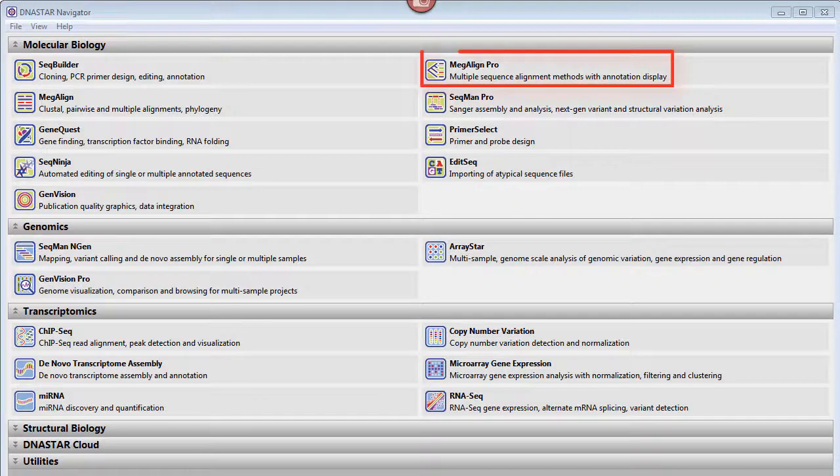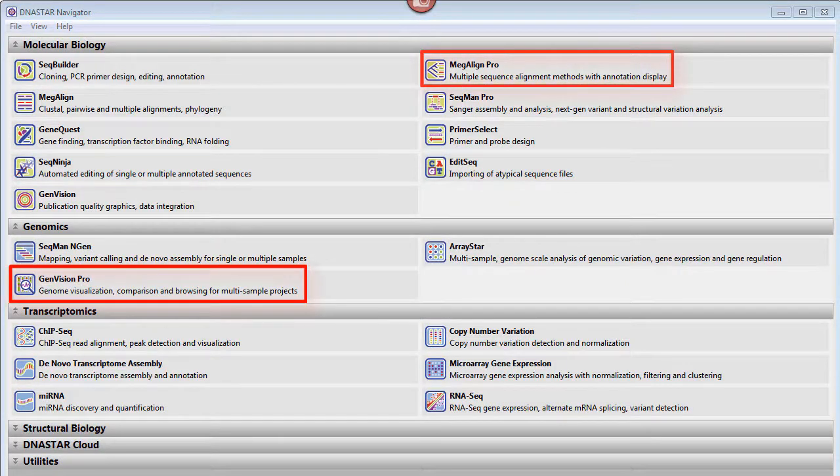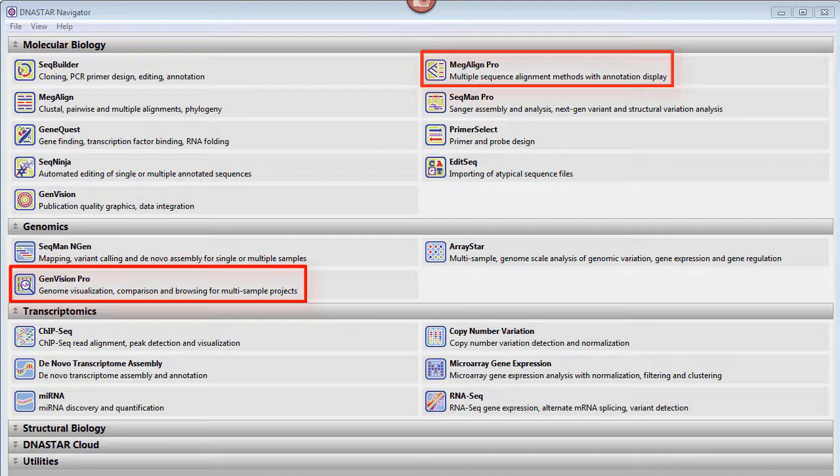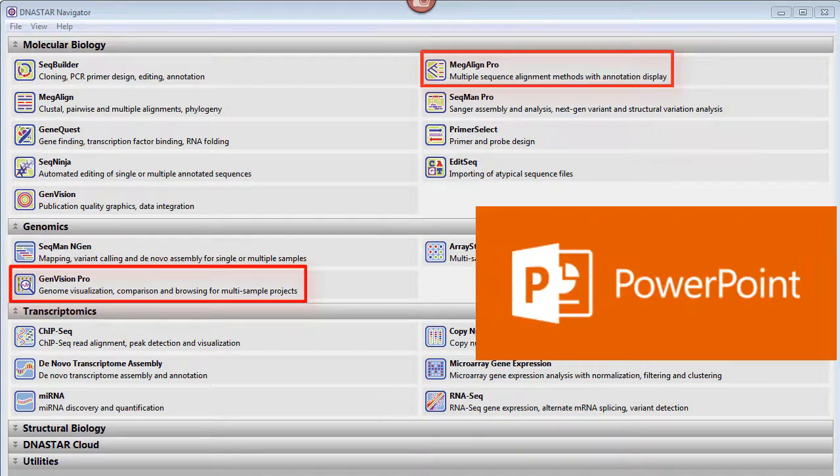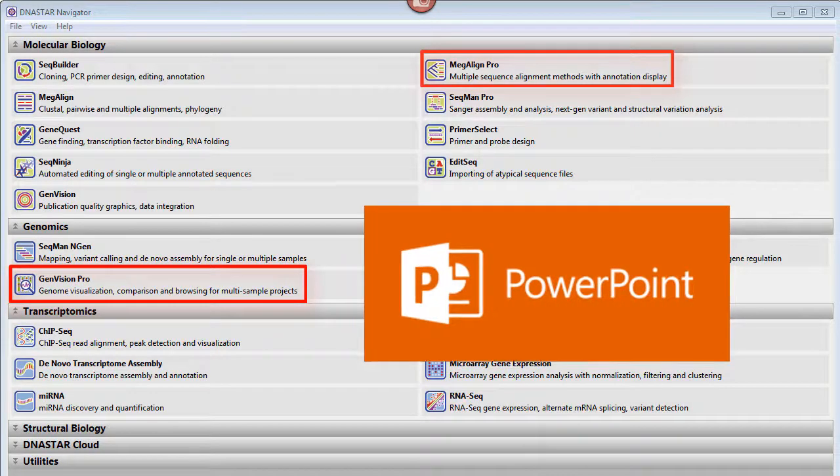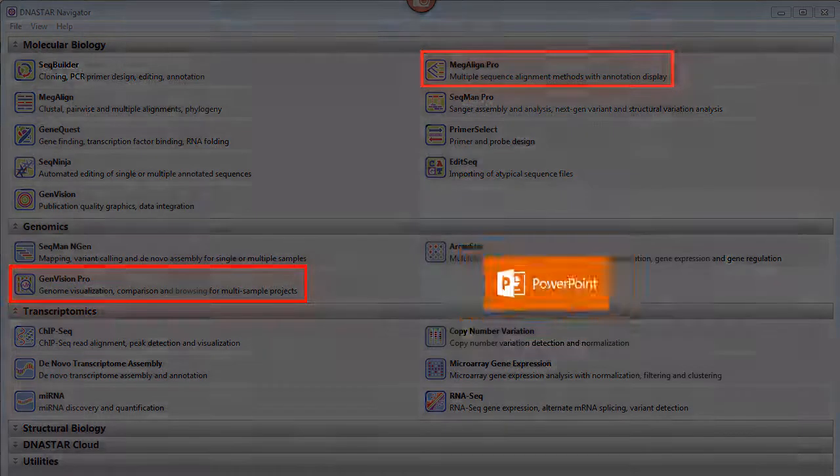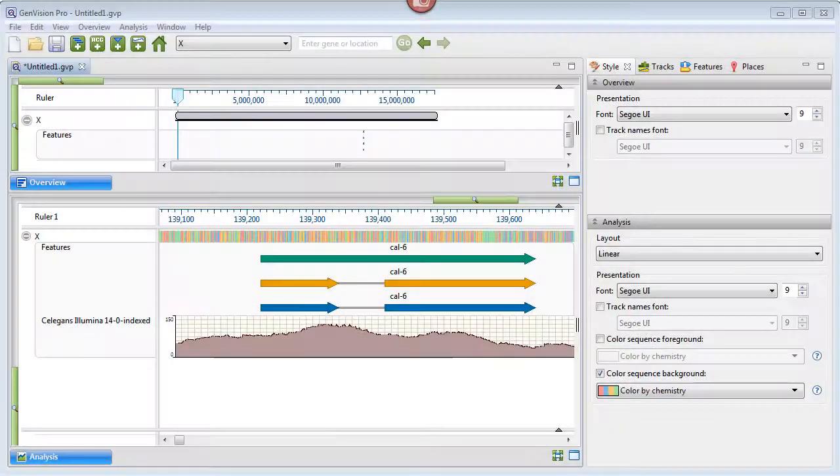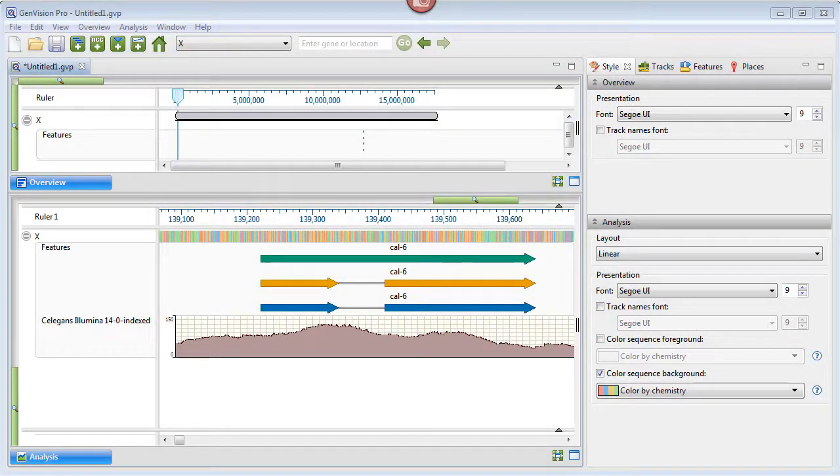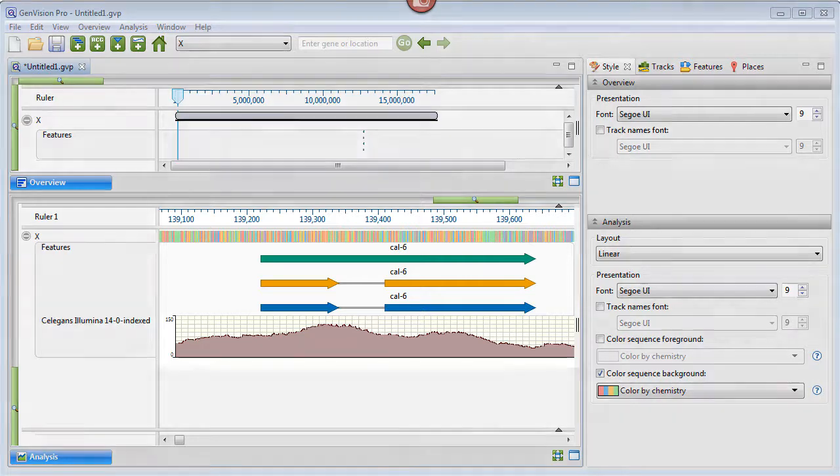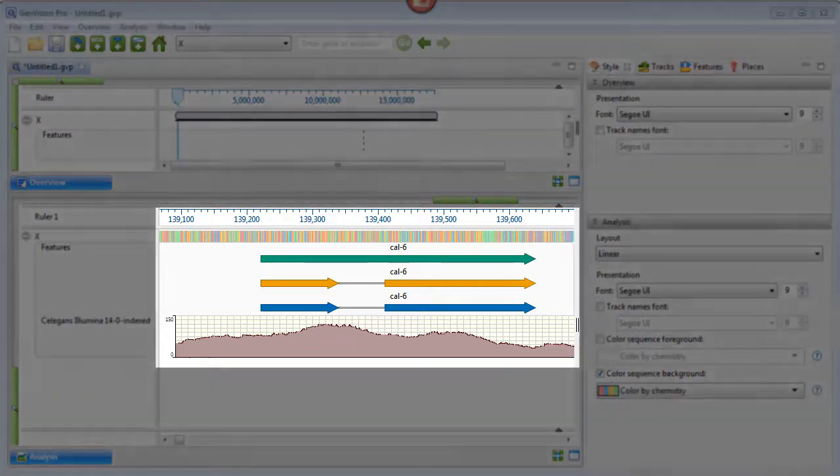LaserGene's Megaline Pro and GenVision Pro applications both allow you to export the visible portion of a graphical view in a format optimized for use with Microsoft PowerPoint. For this brief demo, I've opened the C. elegans genome in GenVision Pro and located a gene of interest that I want to feature in a PowerPoint slide.